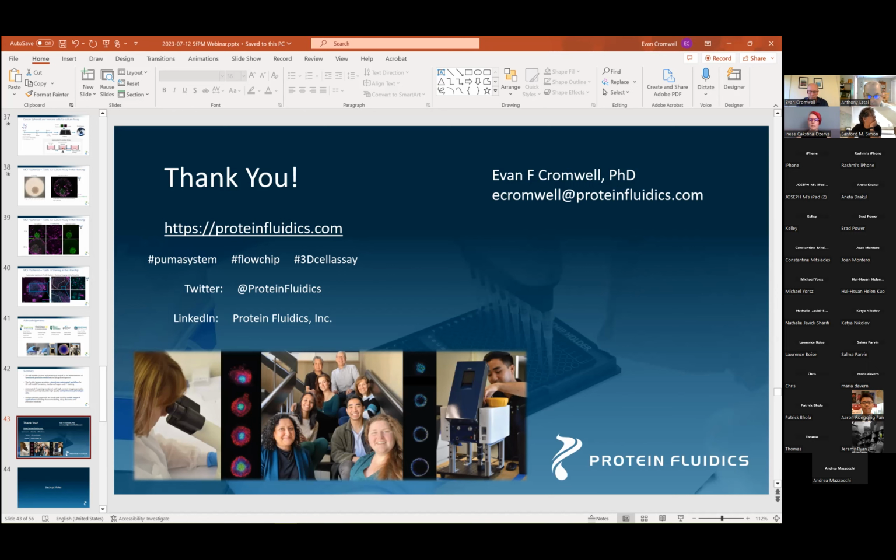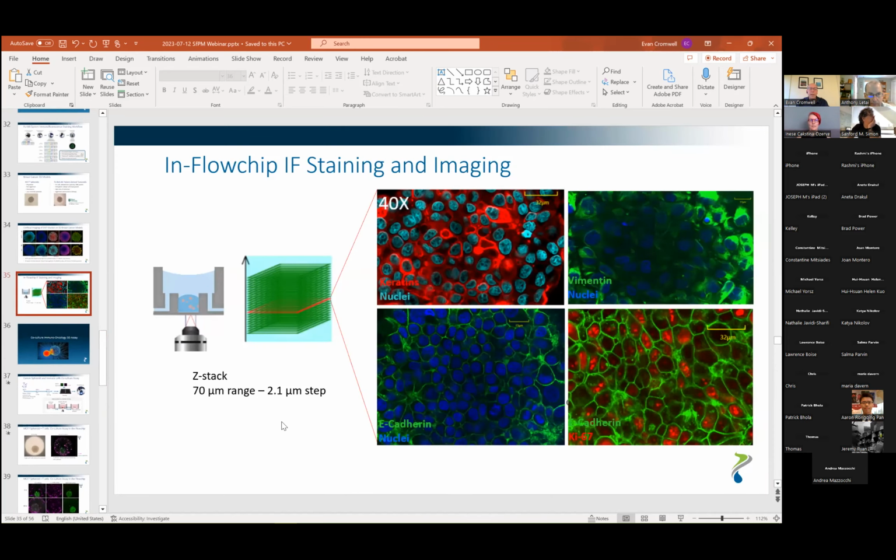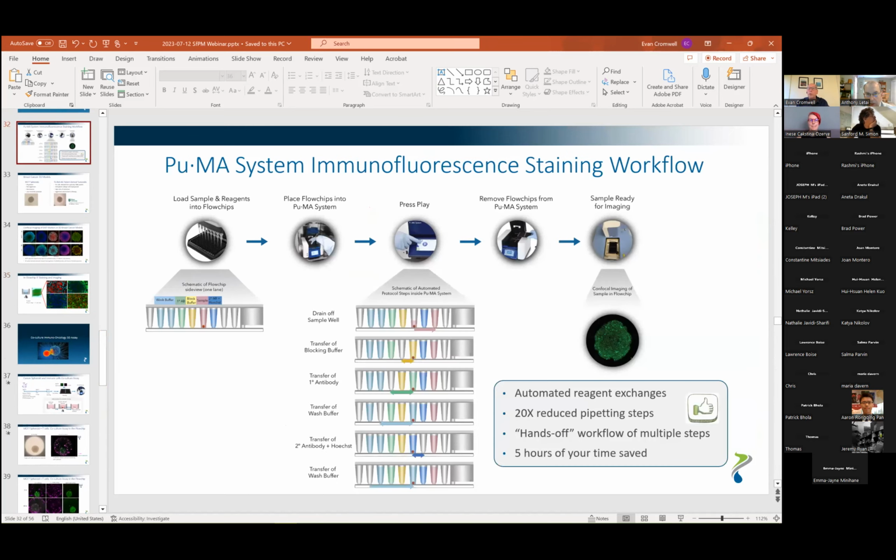There's several questions. I'm going to take my prerogative and ask one. One thing I wasn't clear on is, is the immunofluorescent imaging actually built into that shoebox size device, or do you remove the chip from it to a fluorescent imager? So currently the setup is that you would remove the chip and put it into the imaging system. That's sort of like this shown here.